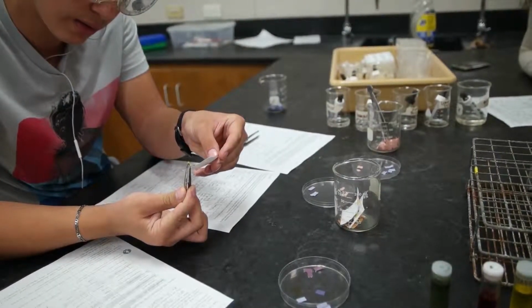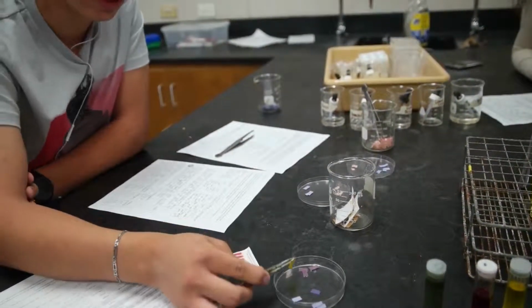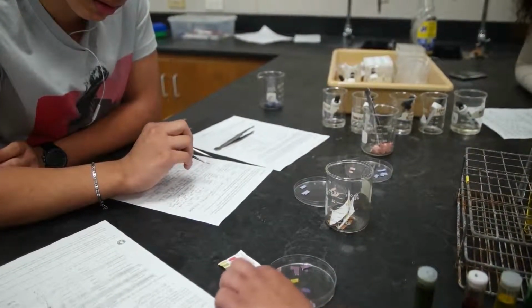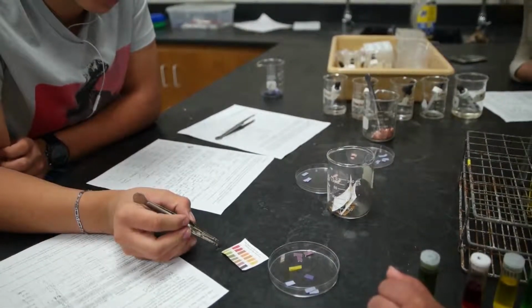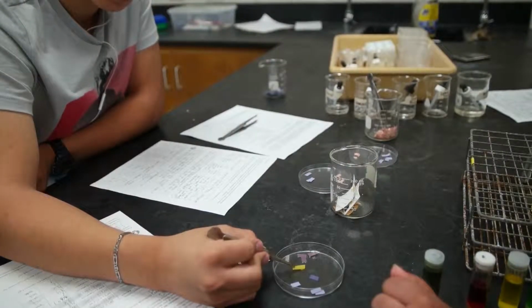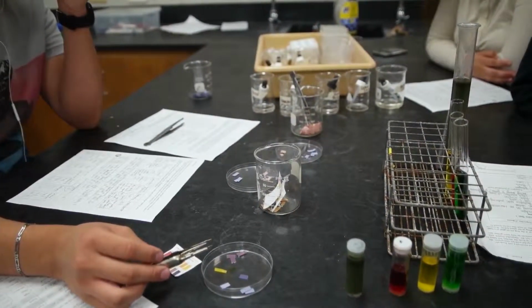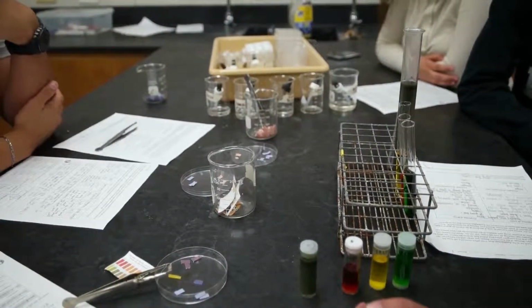So this would be probably pH of 7, which would mean it is a base. Let it set for about 30 seconds and see if it gets a little darker. 7 to me is very yellow. Do you see a darker tint on that maybe? That'll probably be 8. It'll be either 7 or 8. 7 is neutral, so would you hypothesize ammonia as being neutral? No, I would definitely think it's a little closer. So letting it sit, I get a little bit of an idea there.